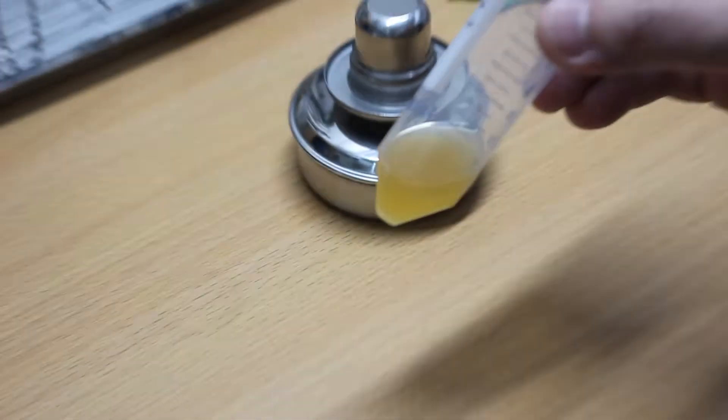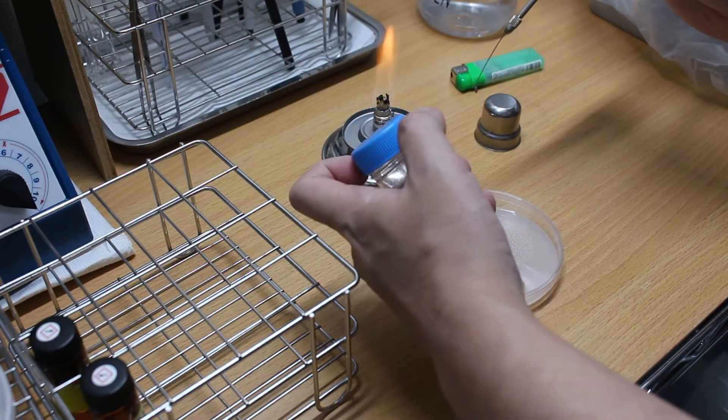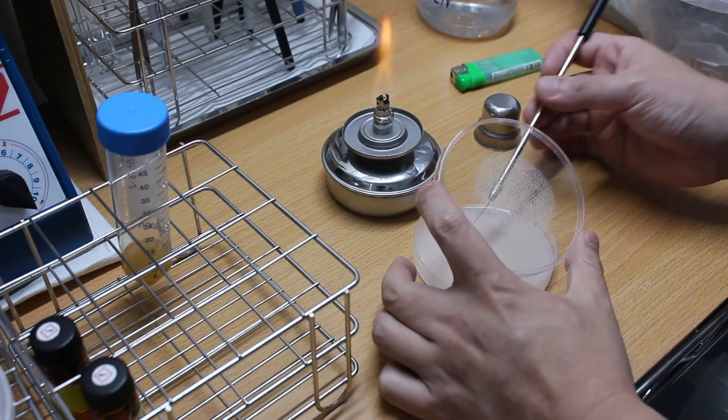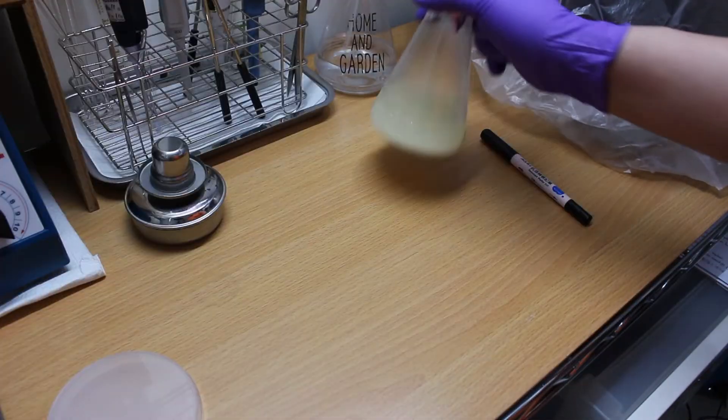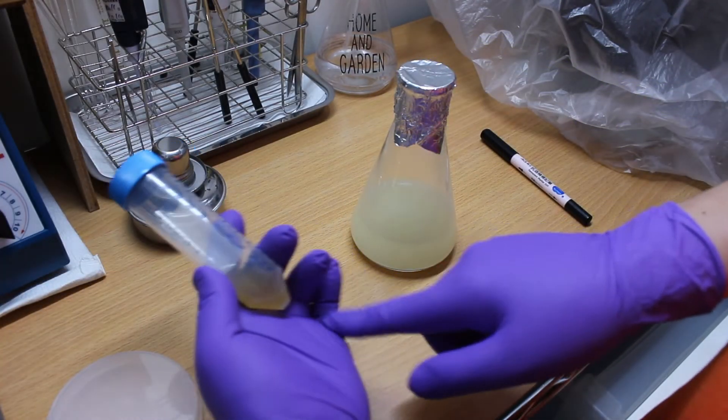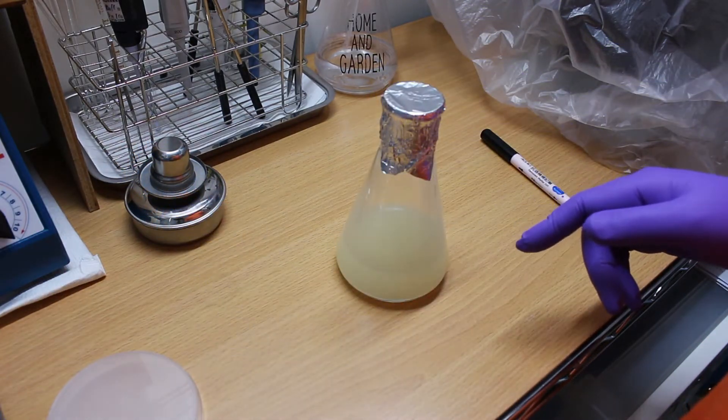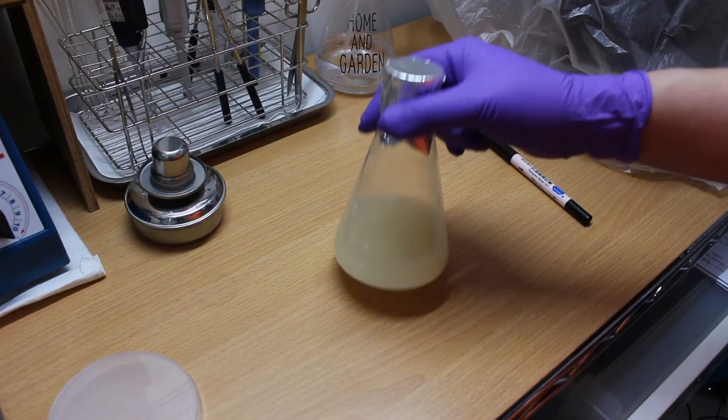So, use an agar plate to confirm that the bacteria are in fact PSB, and then I can start a larger culture. Here, I have increased the 10 milliliters of bacteria culture into 100 milliliters. Of course, you can increase it even more. I'm just demonstrating the principle.